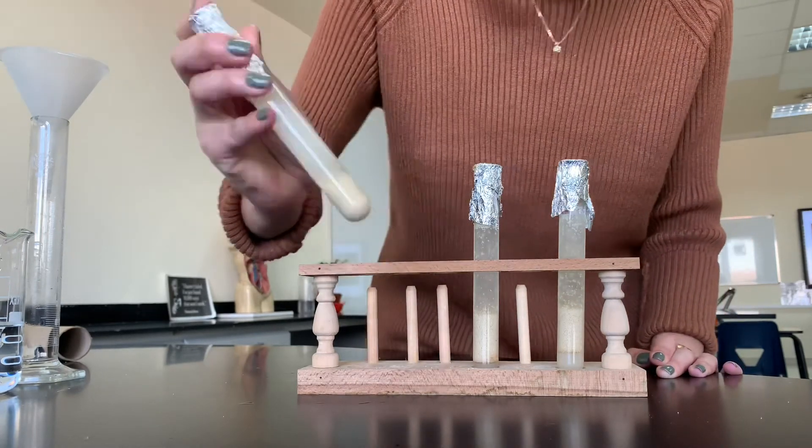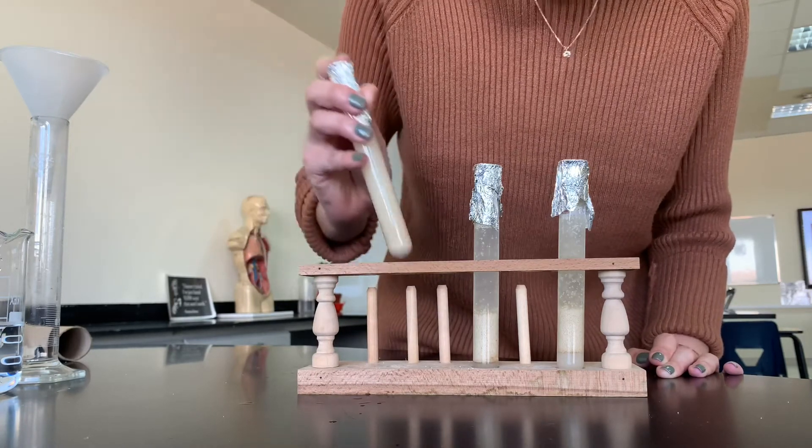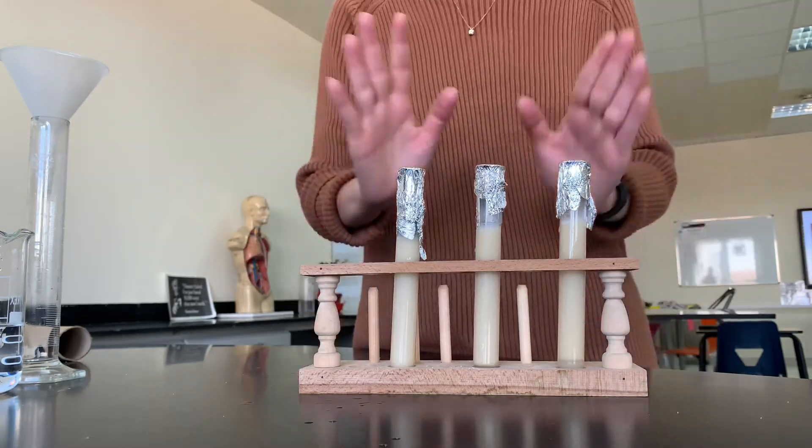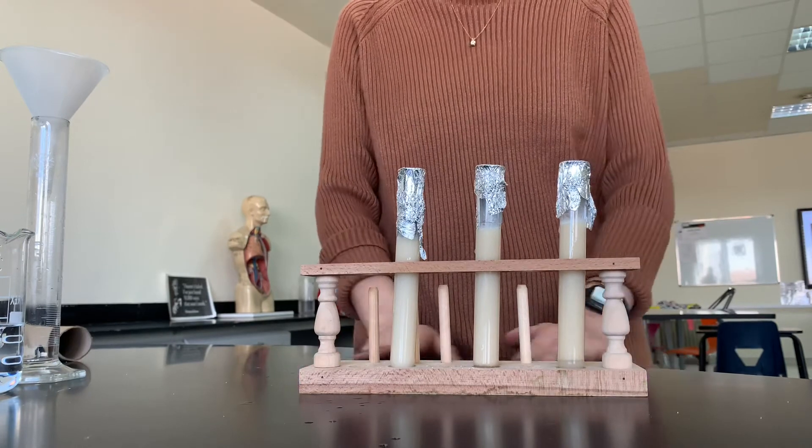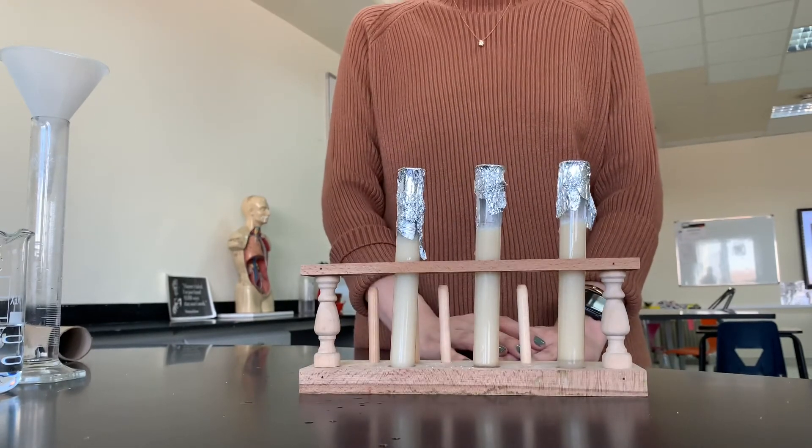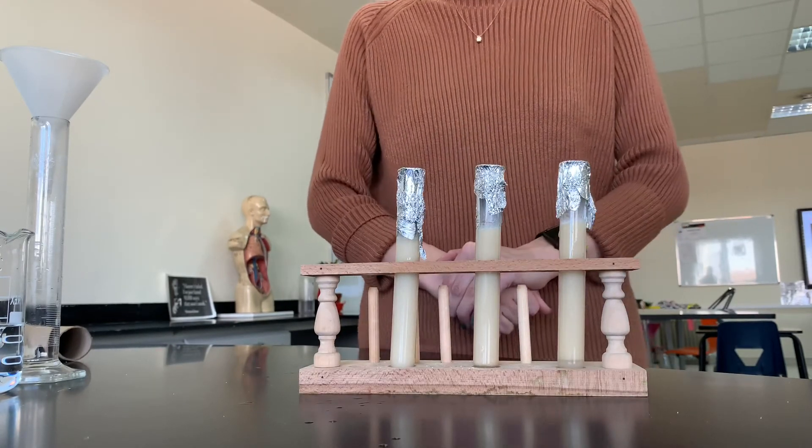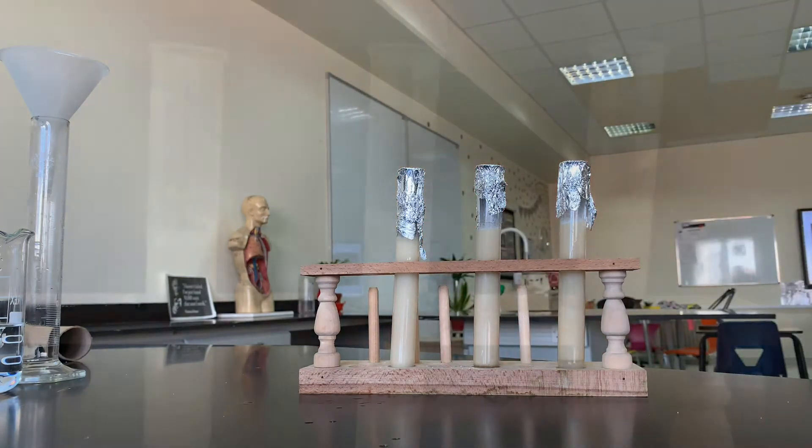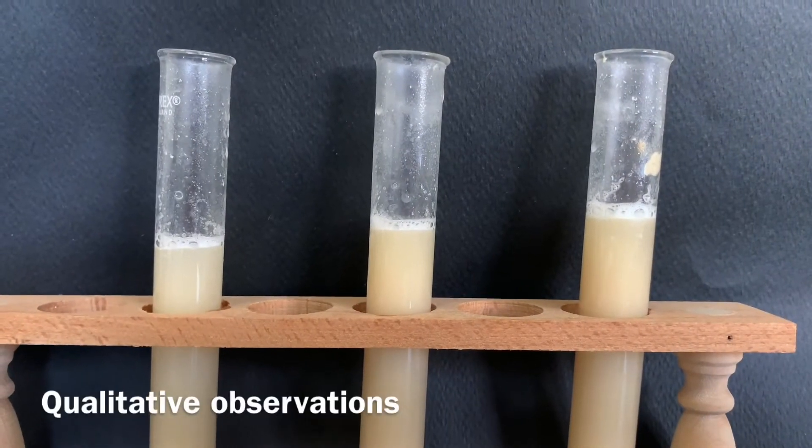Next I'm going to give the test tubes a bit of a shake to mix the sugar and yeast together. Once the test tubes have been gently mixed, I'm going to let them sit for around 10 minutes to allow the reaction to take place. All right, it's been 10 minutes. Let's take a look at the results.